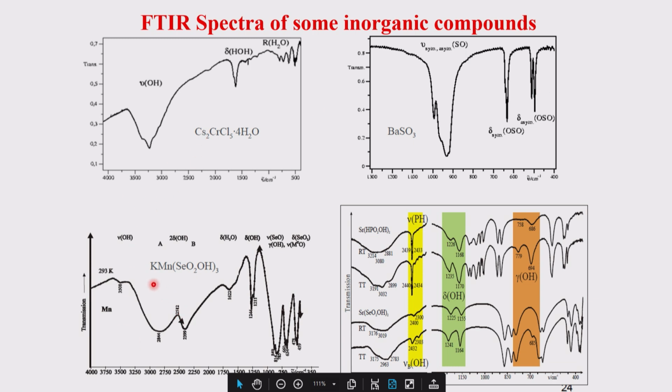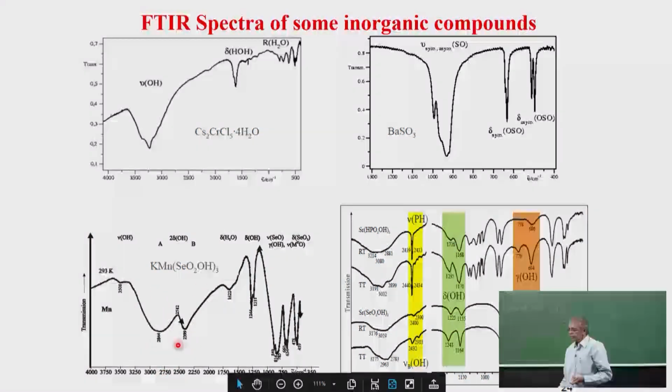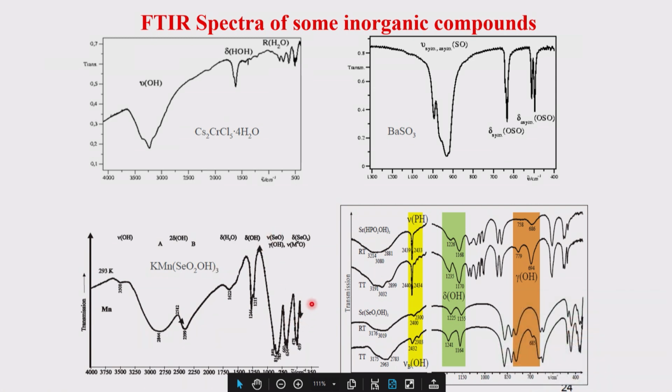So here, KMnSeO2OH. Again you can find a lot of OH, the other things, stretching, bending, and the SeO things, etc. SeO3 vibrations and the rocking vibrations and bending vibrations, they all come here. And this is another extension of that compound you can just sit and look at.